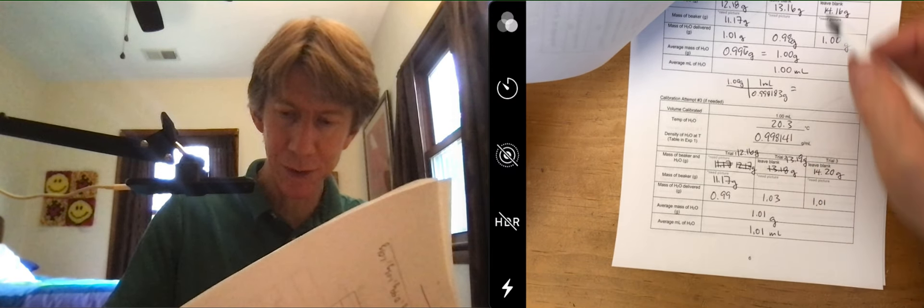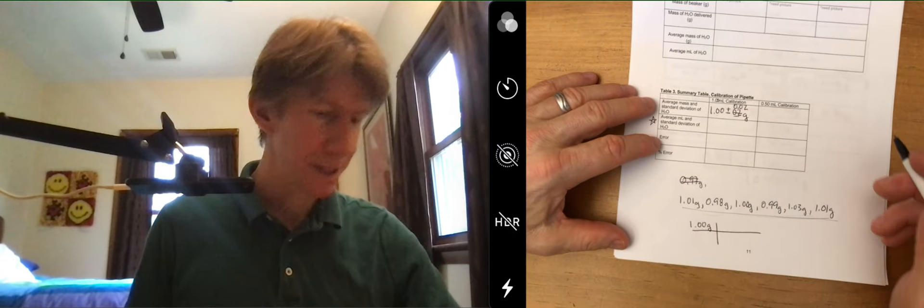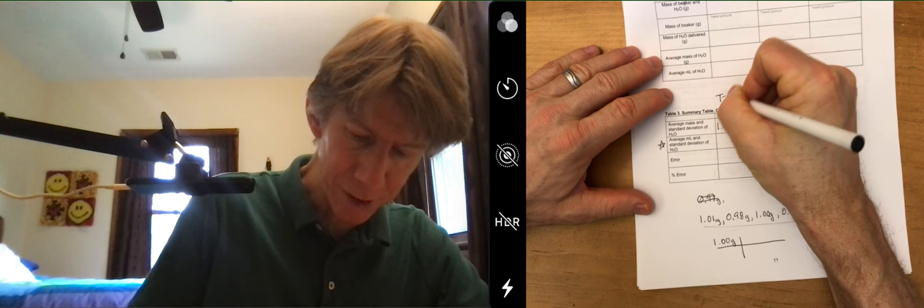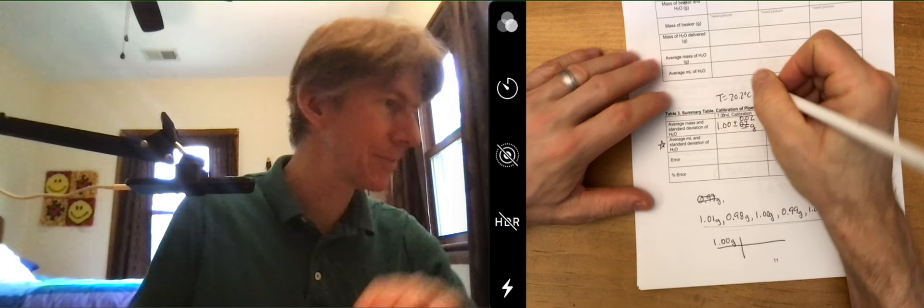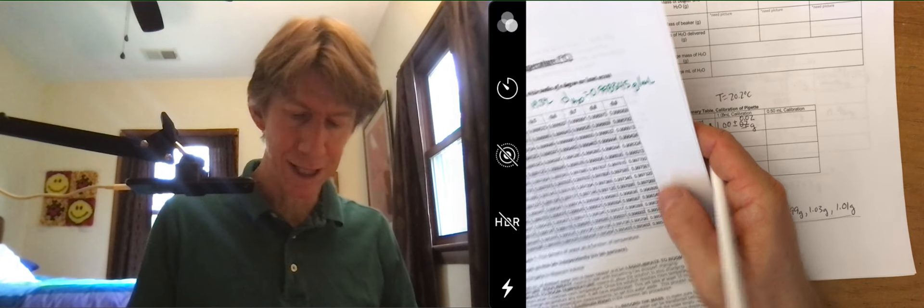So I actually have 20.3, 20.1, oh so 20.2 is my average temperature. So T equals 20.2 degrees Celsius and at my table 20.2 is 0.998365 grams per milliliter.